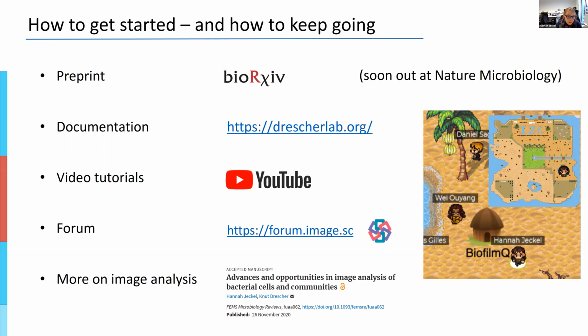There is this forum, and we are very happy to get in touch with you in the forum. People are also writing requests about what they would like to improve about BiofilmQ, or if they have found any bugs. So this is really the place to contact us. If you have very specific issues, you can also write us an email. But in principle, the forum is really a good place because you can search it. Maybe someone else has had the same problem. Maybe someone else can help you. Currently, we're always answering ourselves, but maybe at some point, if the community has grown, people can also help each other.